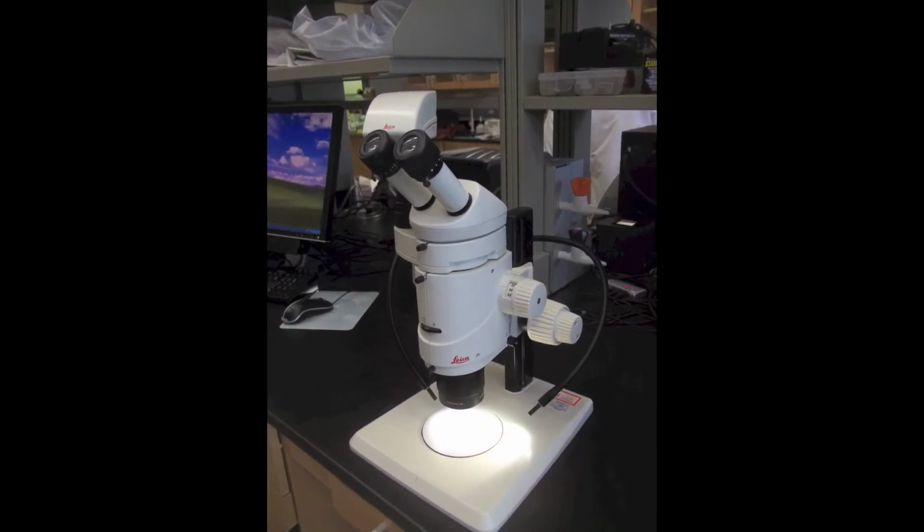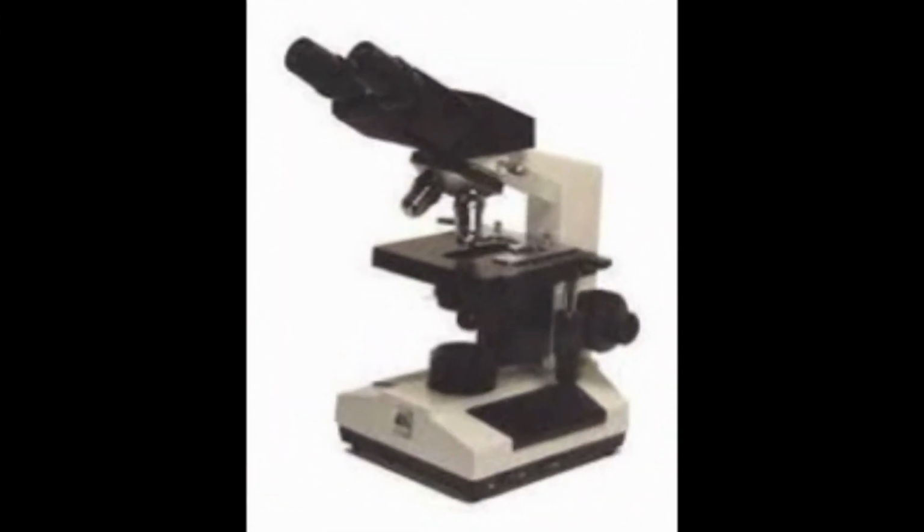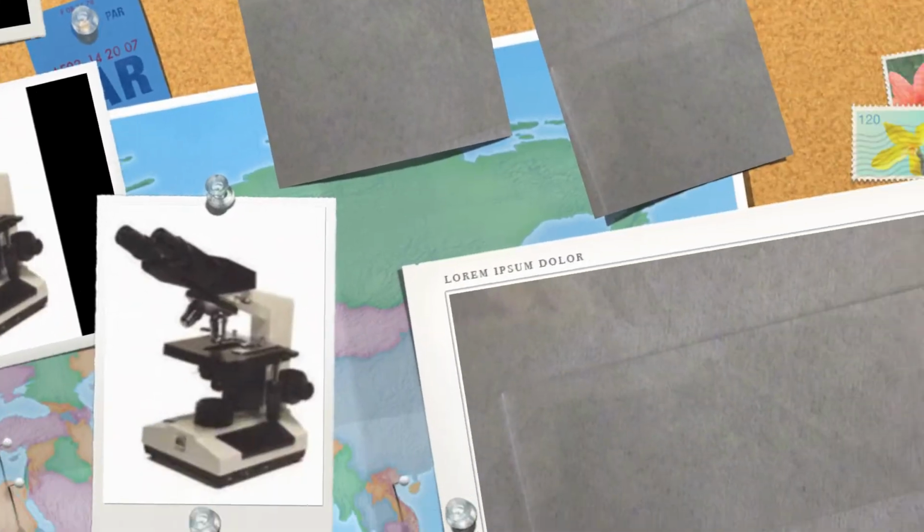Hair is typically observed under both the stereo and compound microscopes. A stereo microscope allows observation of macroscopic characteristics. These include the color, form, diameter, and length of the hair. On the other hand, a compound microscope allows microscopic observations of the hair. These include the reflected color, microscopic structure, and cross-sectional shape.